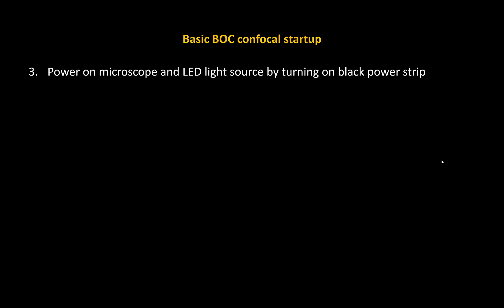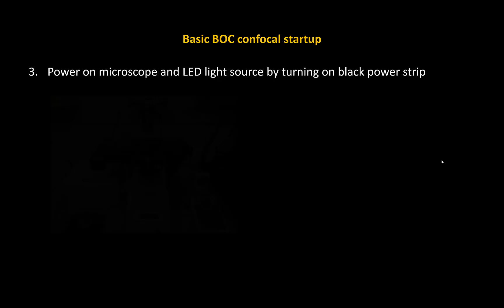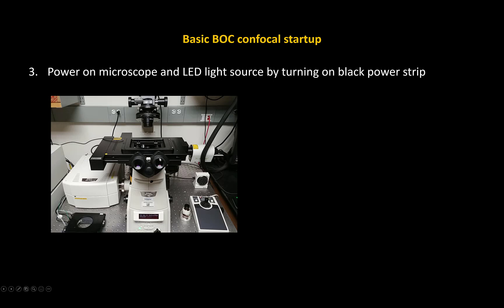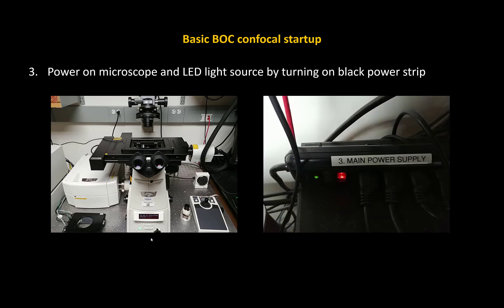The next step is to power on the microscope and the LED light source by turning on the black power strip. For our confocal setup, we can also use an LED light source for basic fluorescence viewing — you don't have to use the detectors and lasers just to look at your sample. The LED light source can be used with the oculars to view your sample on the stage without going to the computer. It's useful for quickly checking whether your fluorophore is active. Turn on the power strip — it's labeled and located behind everything — and it will power the microscope and LED light source.